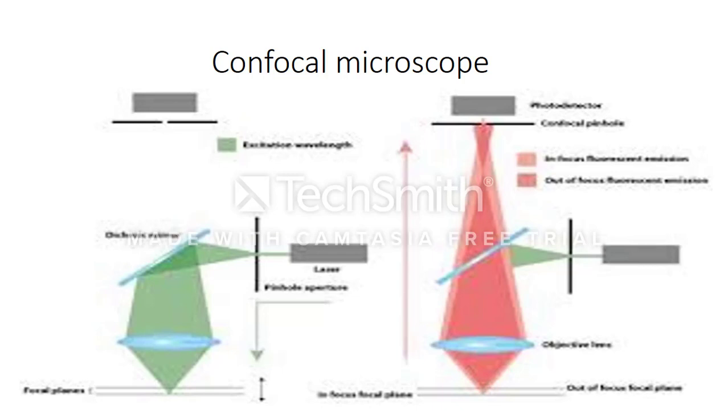And now we fuse this GFP and the fusion protein into a cell, and the cell will begin producing this protein with fluorescence. And now we can look at this protein get produced in the cell from this confocal microscope.